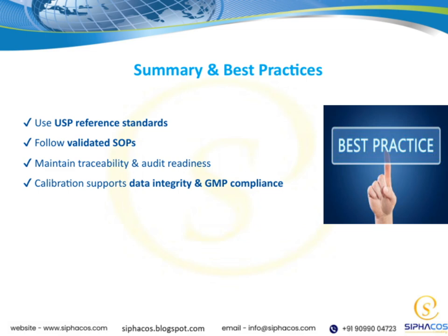Lastly, calibration plays a vital role in supporting data integrity and GMP compliance. Regular calibration ensures your instruments are accurate, which directly impacts the quality and reliability of your results. By integrating these practices, we reinforce the overall quality system and uphold the integrity of our work.